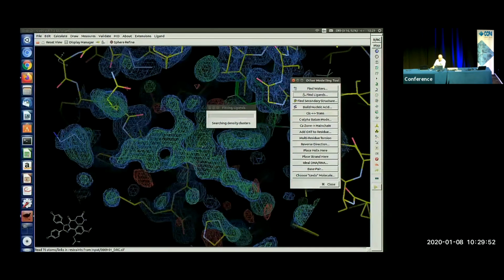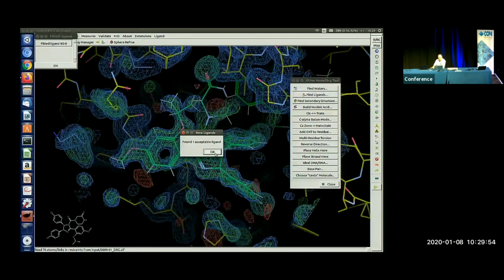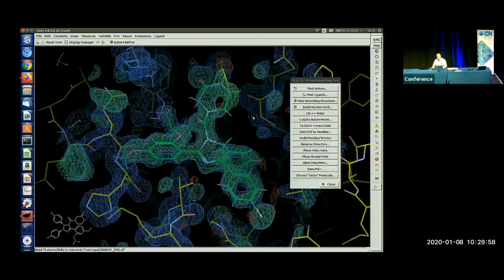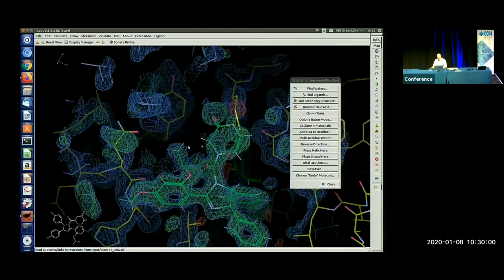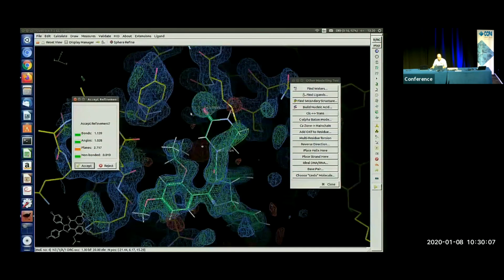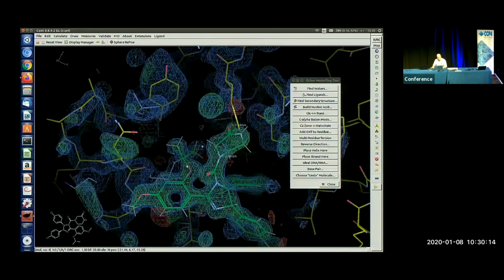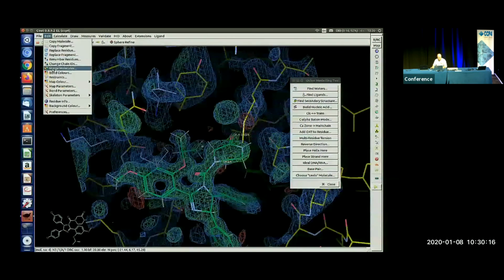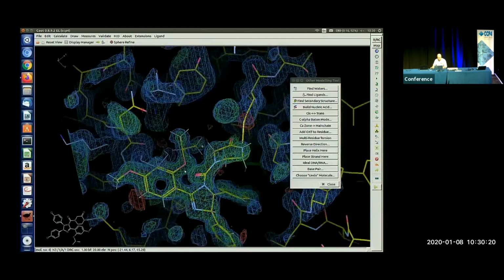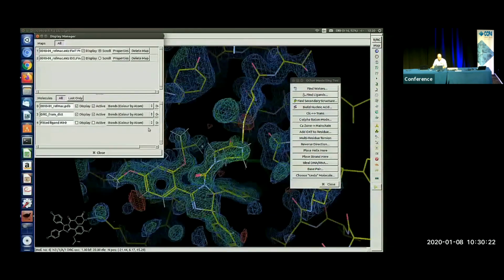What it's doing, there we go. That looks good, so okay. And there we are, our ligand is fit, and it's gotten a bit wrong up there, so I'll try and fix that. All right, it's a bit better. And then we can just merge the model in. I'll get rid of the copies that we don't need.